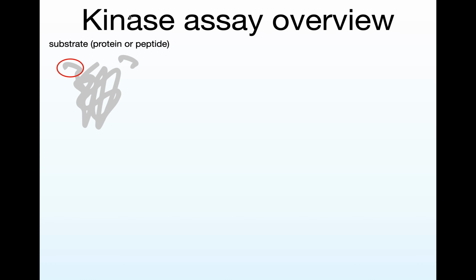But peptides don't always work. If the kinase is phosphorylating a more structured part, or if it's interacting with the protein in other ways or getting other cues, the peptides won't work in all cases. But you can use this assay with proteins or with peptides. I've actually worked with the whole protein, but you need to make sure it's really pure so you don't detect any background, and you have to take a lot of controls. But anyway, back to the story.